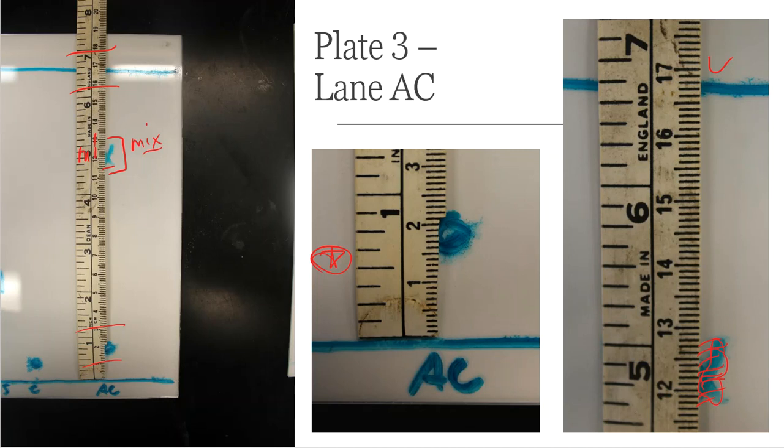All right. So this is not a lab notebook entry. This is pretty much just a standard fill in the blank, answer the couple of questions, scan it, and turn it in. And that's what this TLC plate lab experiment is all about.